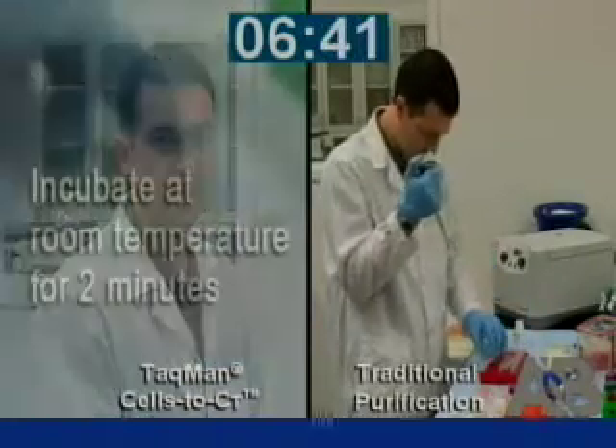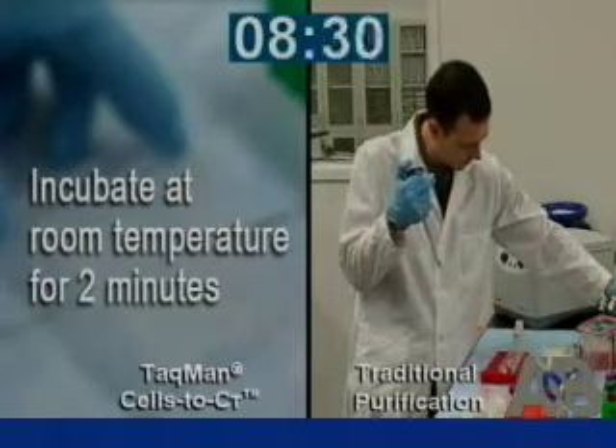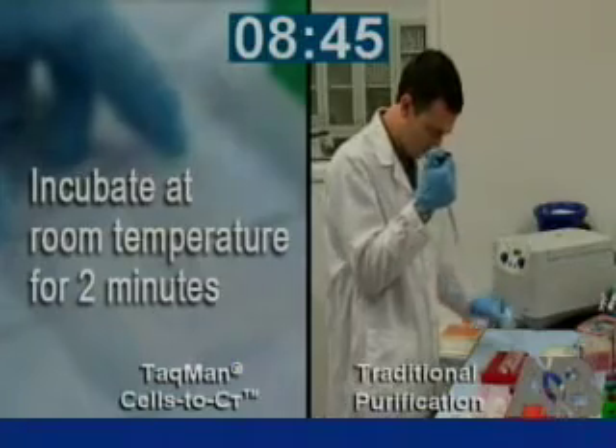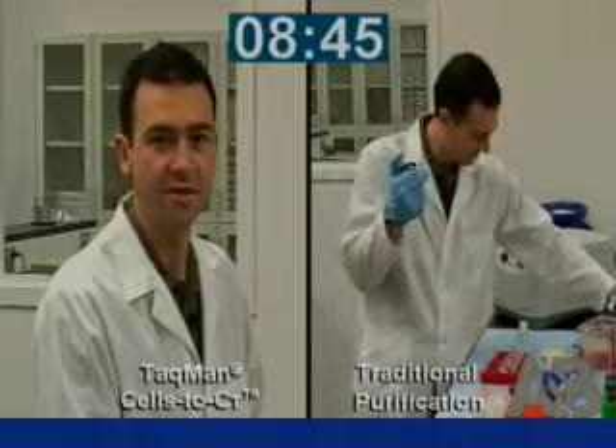After we've added stop solution to the last row, we again incubate for two minutes at room temperature. And after less than 10 minutes, we've processed 96 samples that are now ready for reverse transcription.